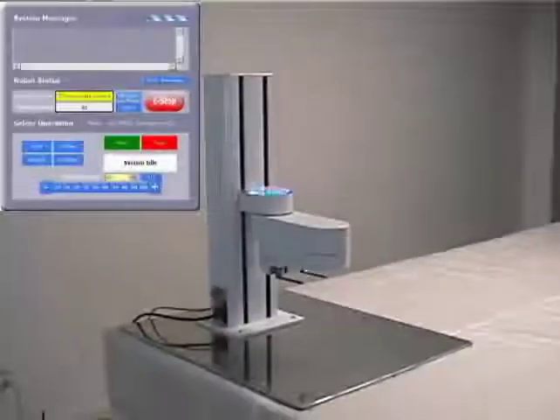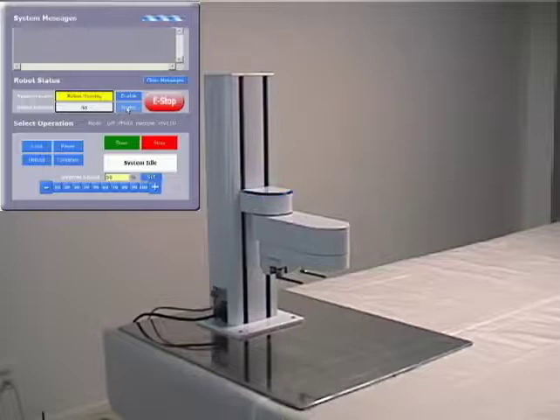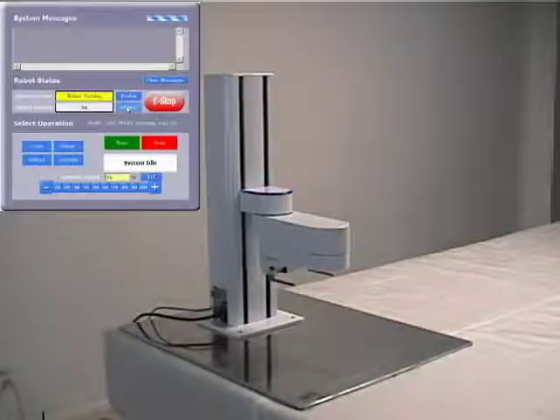Once the robot is plugged in, it is a simple matter to enable power to the motors and home the robot. While homing, none of the major axes move. This is because of the absolute encoder motors found in all primary axes of the PF400, which allows for motionless homing, avoiding the large startup motions needed by some other robots.